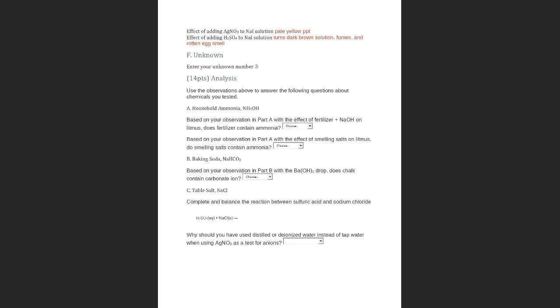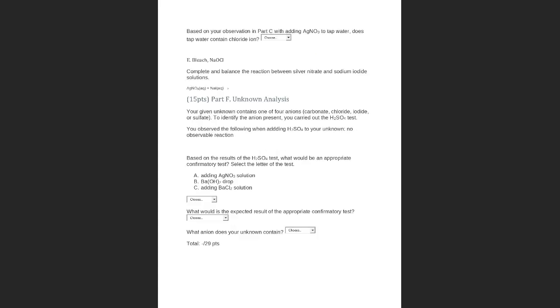It's not going to work. And here in the last part, it says the tap water contains chloride ion. Well, you will see based on the observations in red.